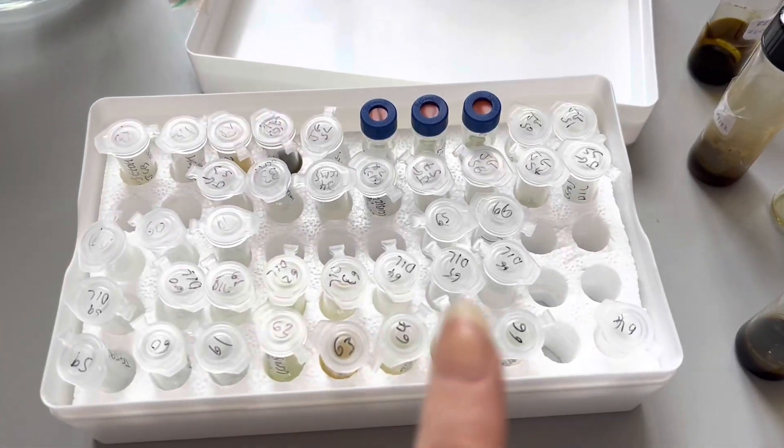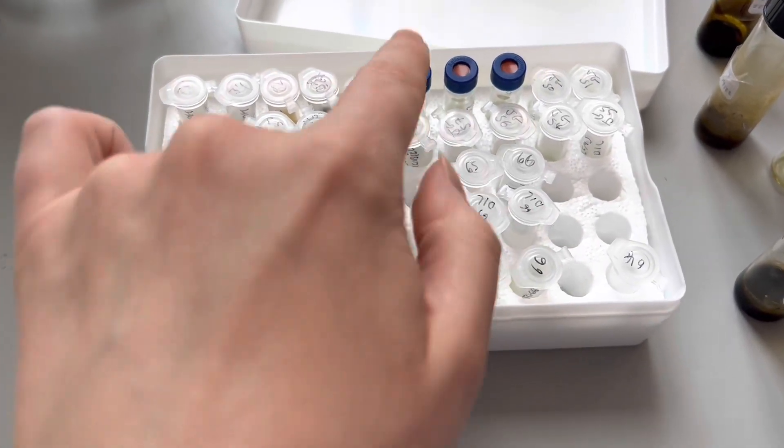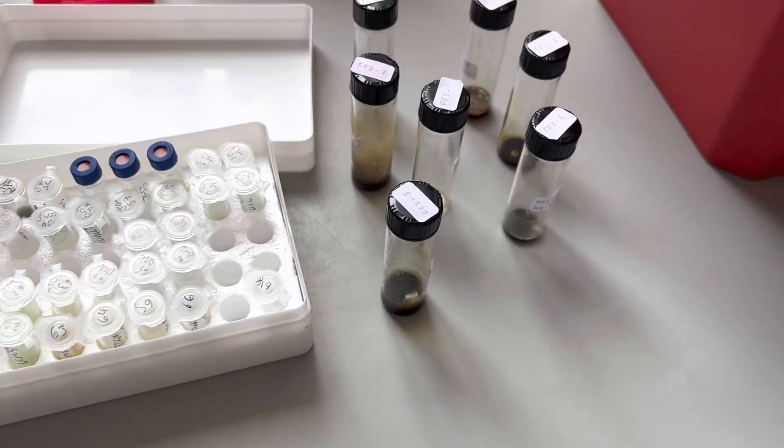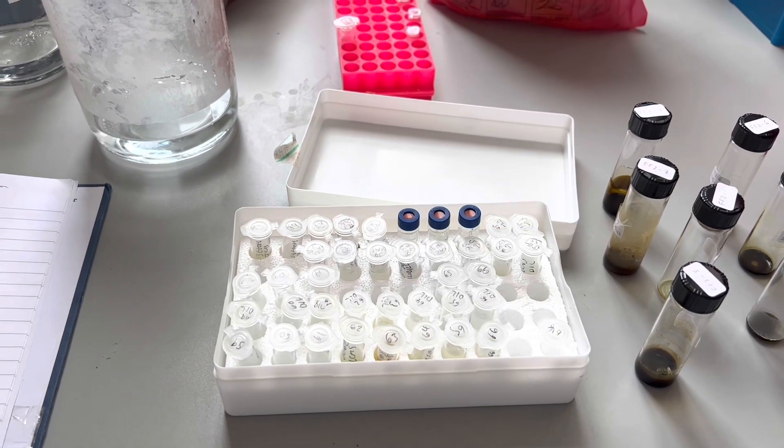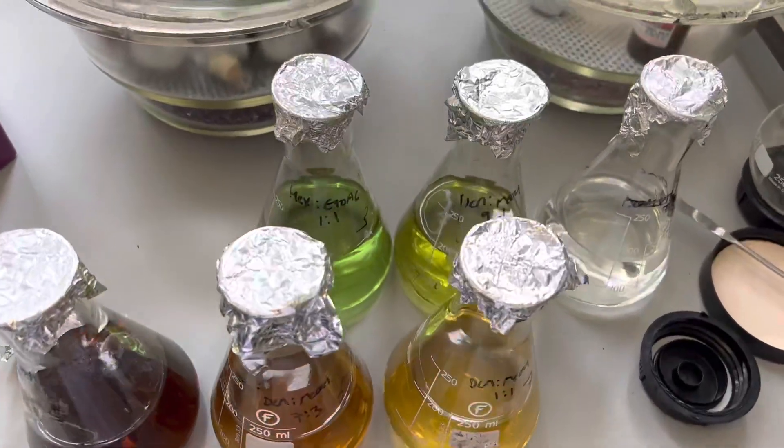I'm doing a task I've been putting off for a long time. I'm waiting for my sample to dry on the rotovap, and I need to prepare new LCMS vials and new LCMS samples so I can compare the results from this VLC to the previous one, to make sure everything was the same so I can combine the fractions together. I also have all the old samples that I need to put back into their original vials — I have all my Eppendorfs and the LCMS vials. It's just one of those boring tasks you keep putting off. I'm going to put on a podcast and just get on with it.